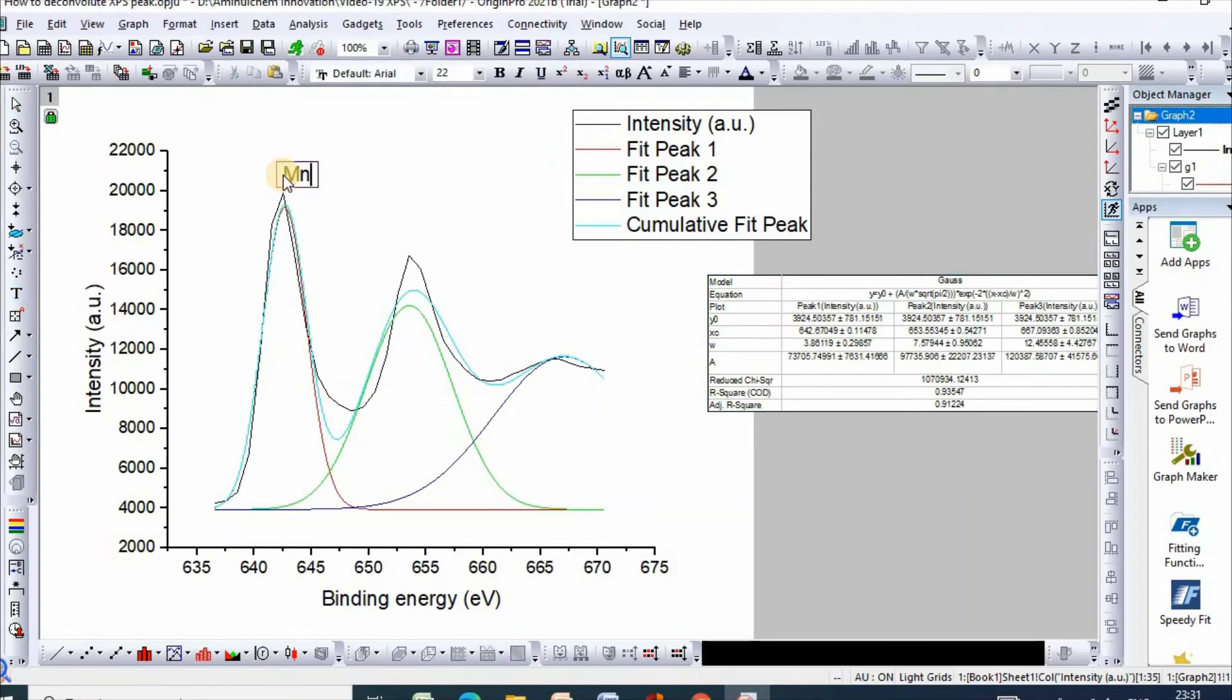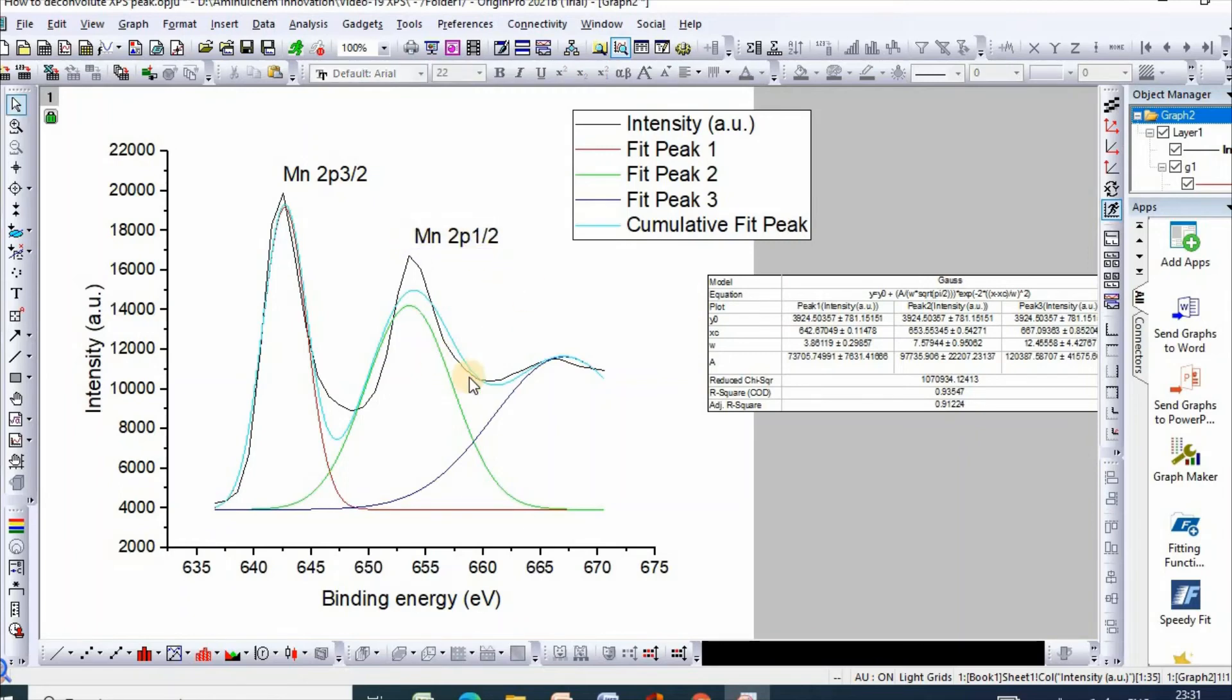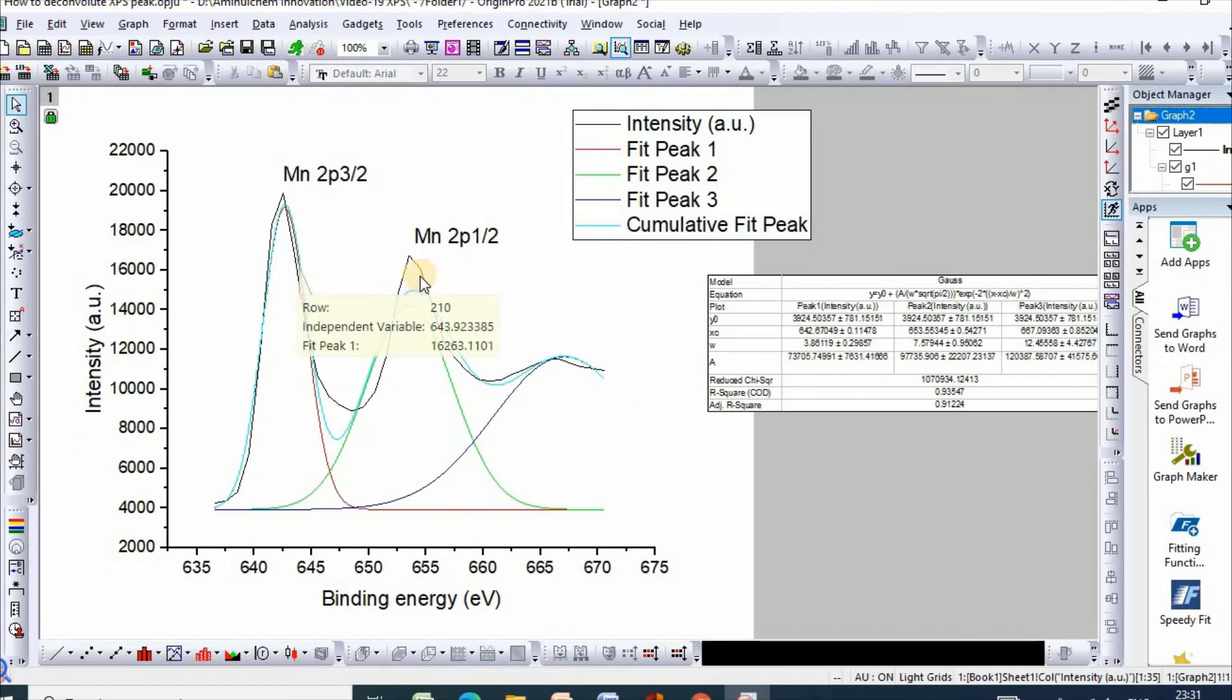And this one is for manganese 2p1/2. You can also modify this to make it publication quality, and you can also add bonding patterns for these deconvoluted peaks.